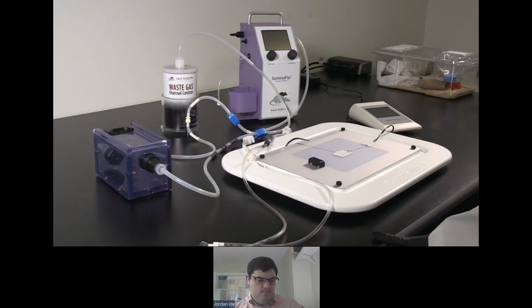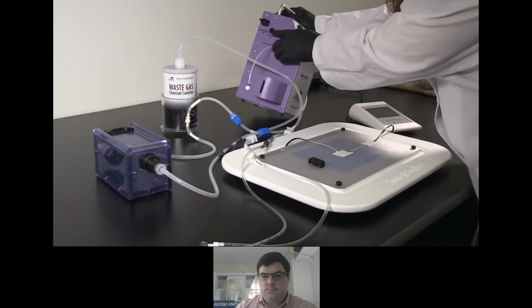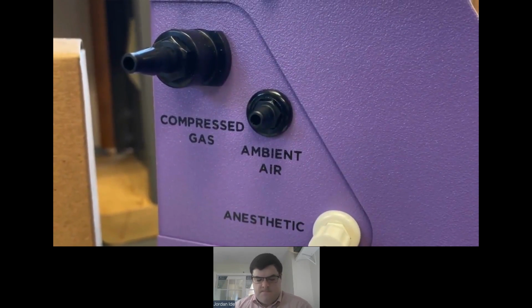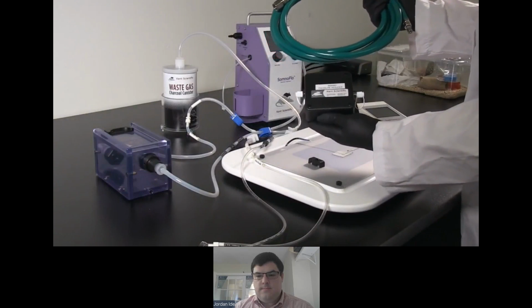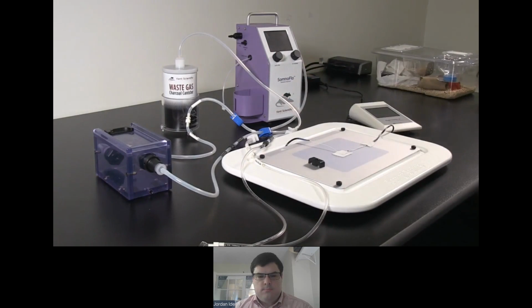The SomnoFlow can deliver anesthesia without the need for compressed gas. If you're using ambient air from the system's internal pump, leave the air inlet open. If you wish to use a compressed gas source, use the compressed gas assembly to connect a pressure-regulated gas source to the SomnoFlow's compressed gas port. The inlet pressure should not exceed 15 psi.